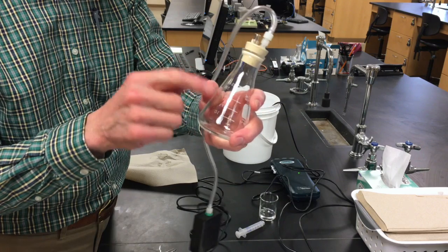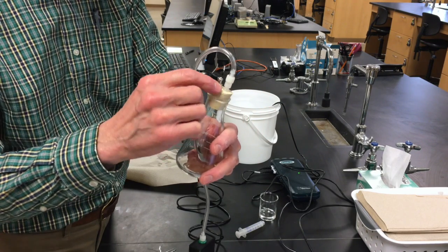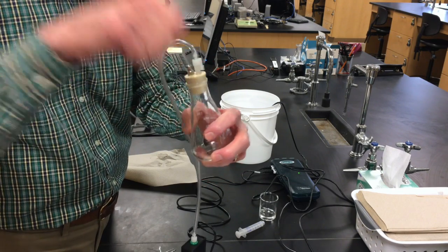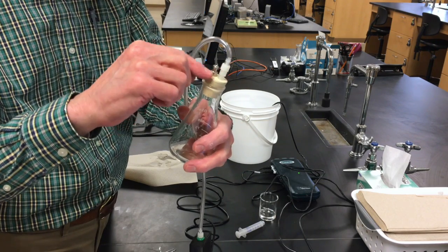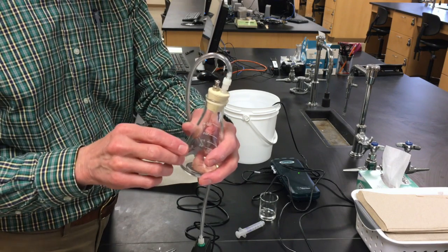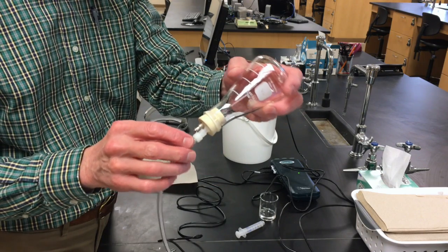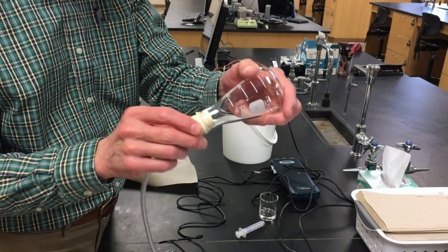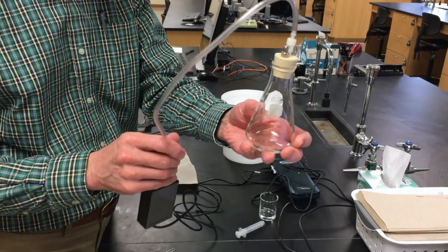Sometimes these Erlenmeyer flasks have a mouth that is a little larger and the stopper will go in deeper. When you twist it in, with a slight amount of water on the outside, if it goes to where the top of the stopper is even with the top of the Erlenmeyer flask, that's not good either. That's probably going to leak as well. So be sure that it looks like it's maybe 1/2 to 3/4 of the way in after you've twisted it firmly, and that's a good seal.